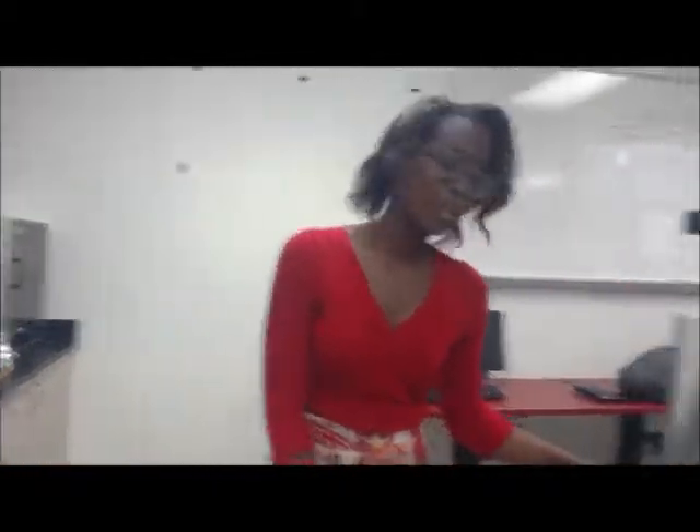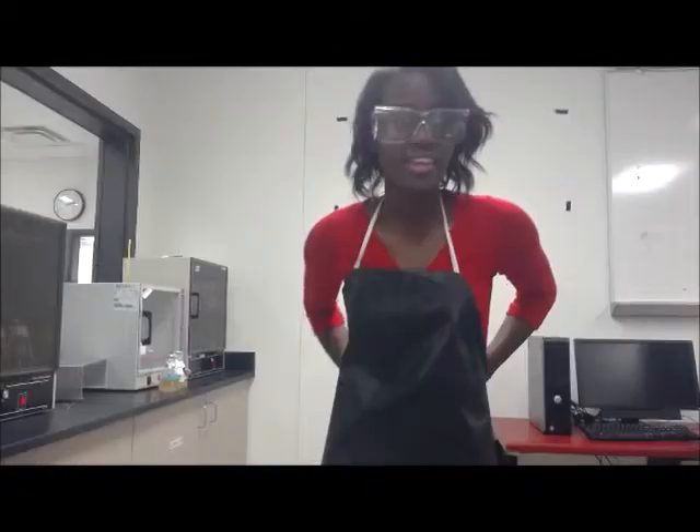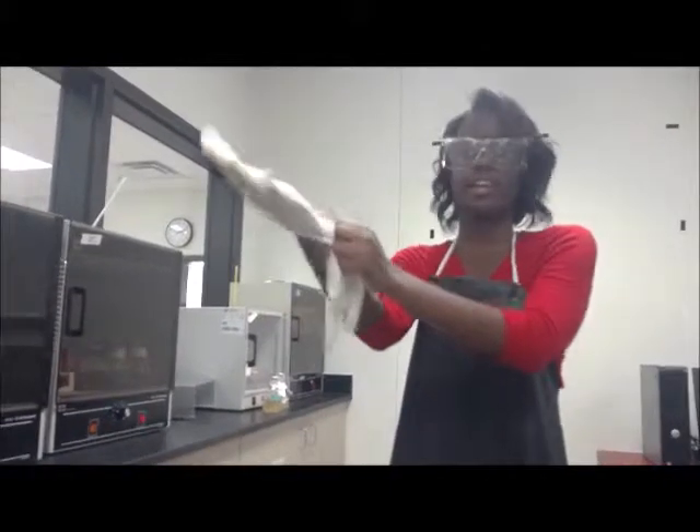It is not safe. So we're going to use goggles to protect our eyes. We're going to use an apron to keep our clothes clean. And then we use gloves to keep our hands safe and from getting bacteria on our hands.